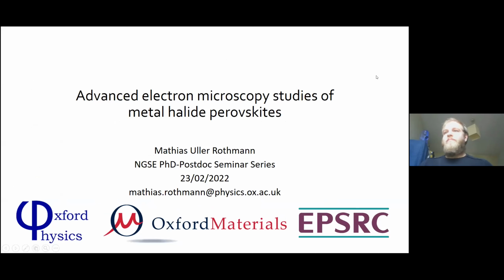So, yeah, I was asked to give this talk about some of the work we've been doing on electron microscopy of metal halide perovskites. And I wanted to divide it into a few different parts where we talk a bit about how we get images from electron microscopes in the first place, and then how we apply it on metal halide perovskites.